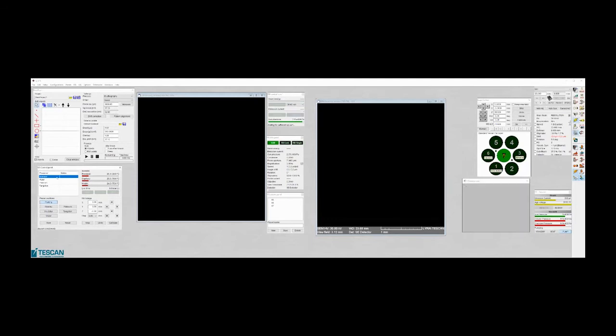As you can see, I said we have the possibility of 5 gases, but we removed fluorine from here. We are not using it a lot for now. Most of the time it is used for faster milling. We are able to create structures from insulators, so there is silicon oxide. We use water for faster etching of carbon materials. Then we have platinum and tungsten. It's a bigger chamber, so we are waiting for vacuum a bit longer.